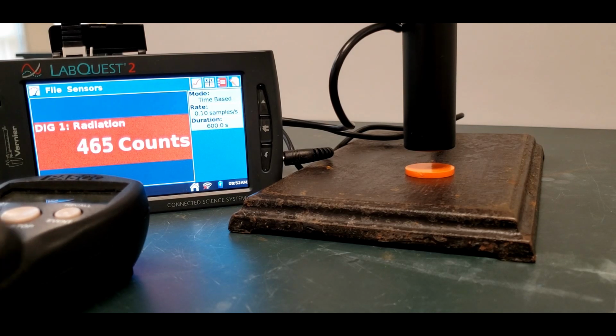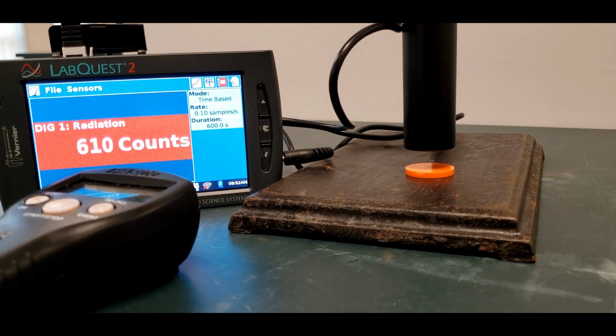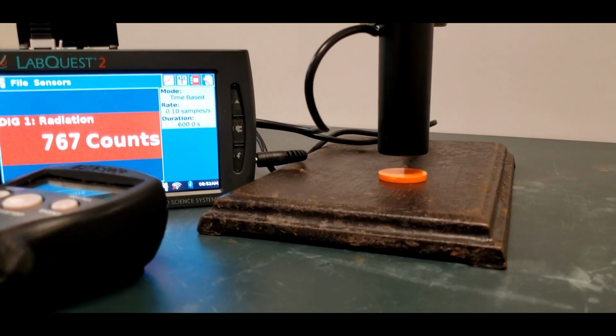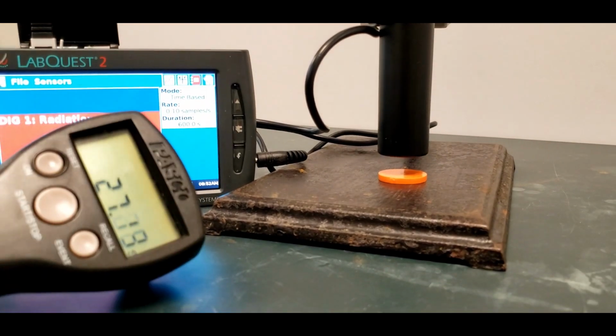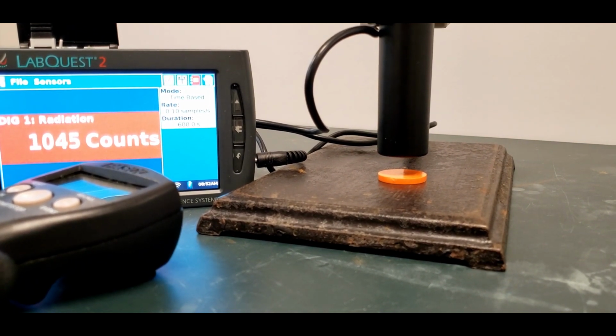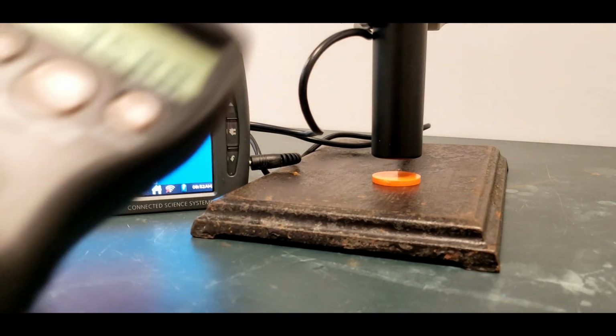So I'm just going to do this first one here so you can see what I'm doing, and then we might do a second one on screen here. I think so. We'll do the 2 centimeter one, but that'll give you an idea of what we're up against here. You can see a lot of counts.